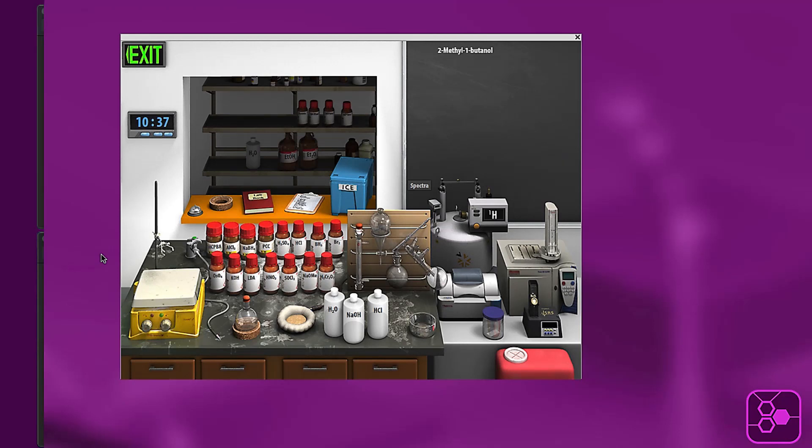Hi everyone, this is Kelsey with BeyondLabs. Today I just wanted to do a quick tutorial on how to do an NMR on your product material in the organic lab.